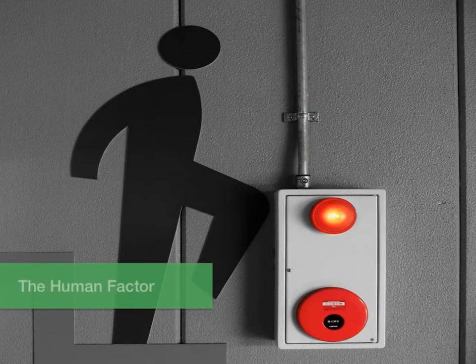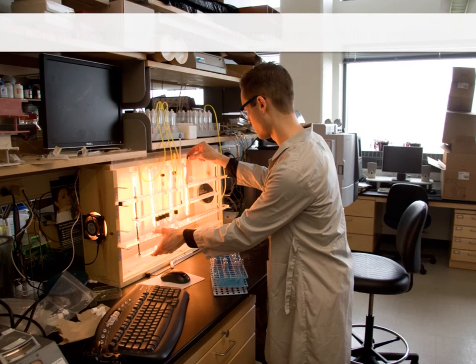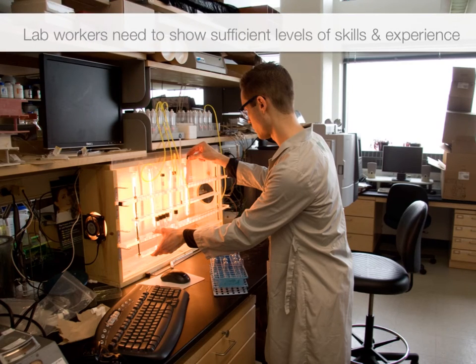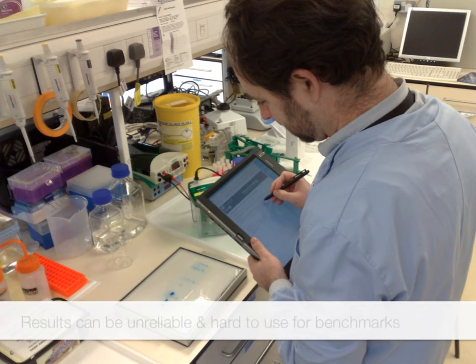The human factor. Traditionally, many of the tasks involved in batch and continuous fermentation tests involve manual operations. This means that the lab worker needs to show a sufficient level of skills and experience. If not enough attention is put into the operation, results can be unreliable and difficult to use for benchmarks.